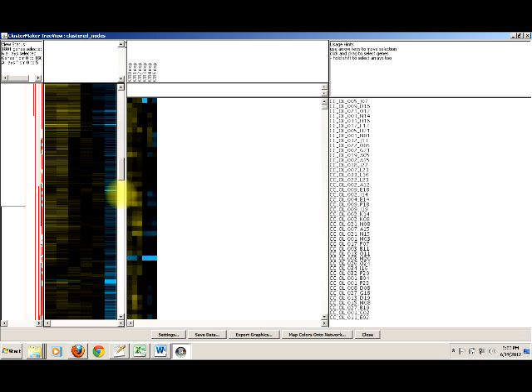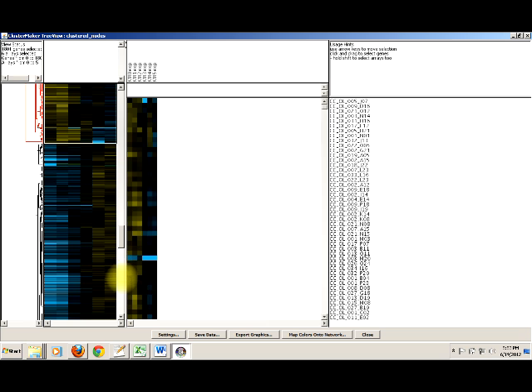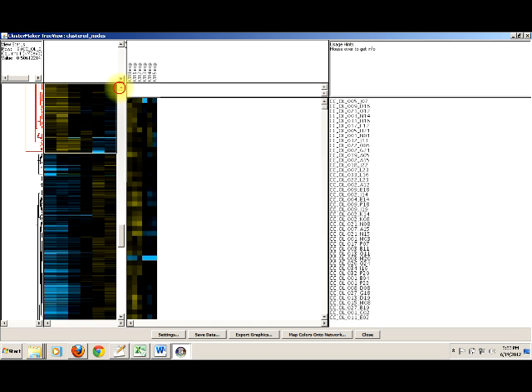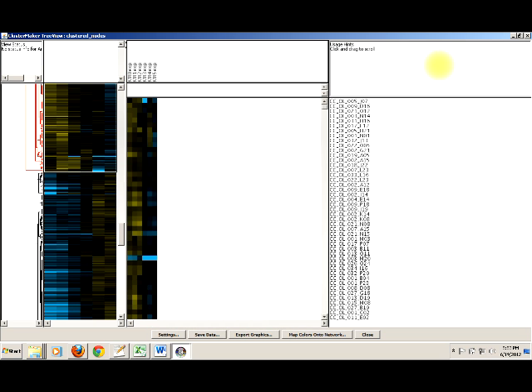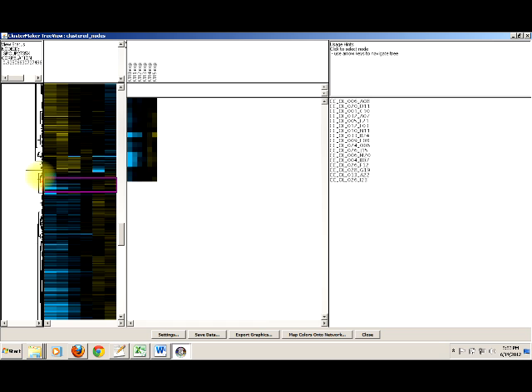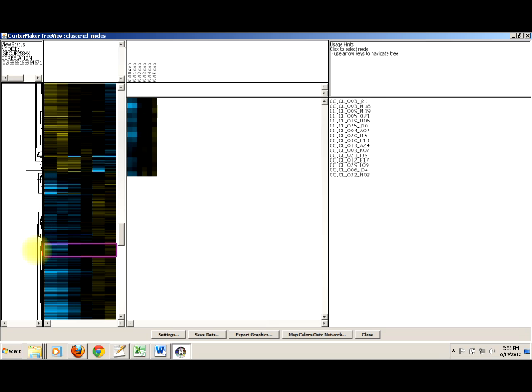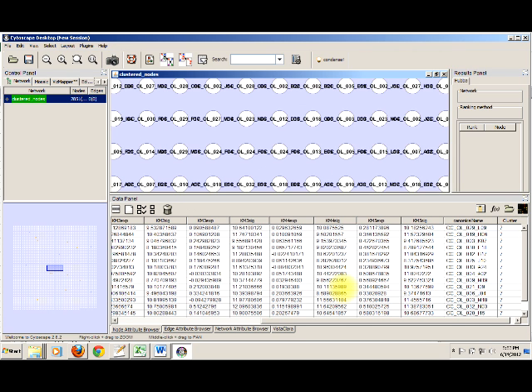One of the things we'll want to see is whether we can replicate this two-giant-node structure in our networks. There's a pretty well-demarcated line separating data that goes from activated to deactivated and from deactivated to activated over time. We'll want to see if we can bring that out in the clusters we create. Keep in mind you can drill down into these hierarchical clusters as finely as you'd like. For now, that's enough to get us to the next step, so we can close this out.